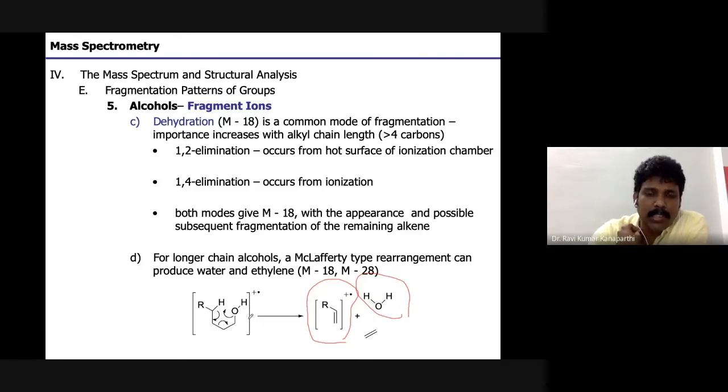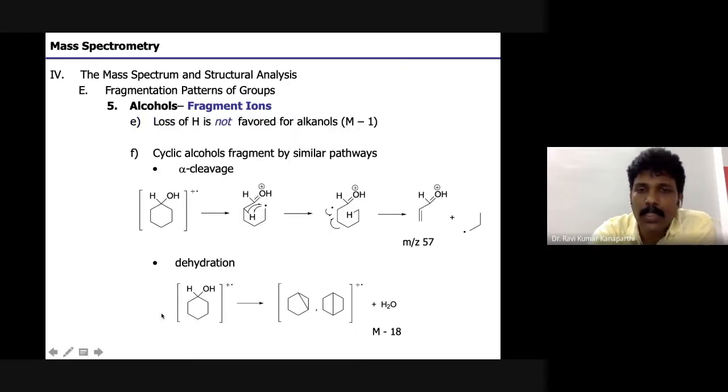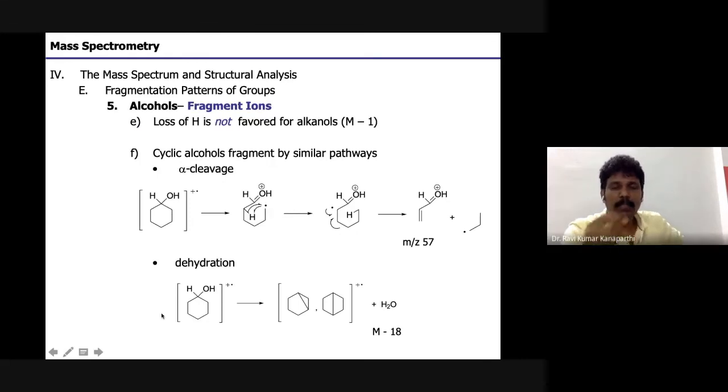Alcohols we are discussing. Alkenes we discussed already. Alkenes, aromatic hydrocarbons we discussed, McLafferty. And it will come out if you have an amide, if you have carboxylic acids, whatnot. So whenever you see a proton at the gamma position to a heteroatom or a ring, those molecules will undergo the McLafferty rearrangement, and corresponding peaks can be observed in the mass spectrum.